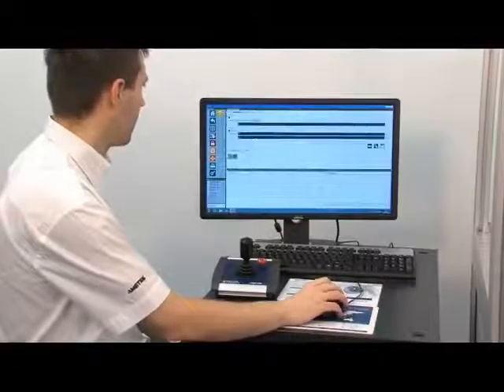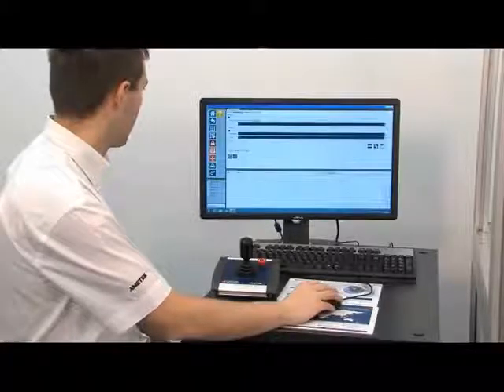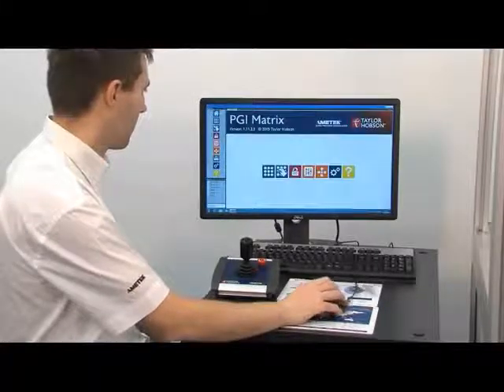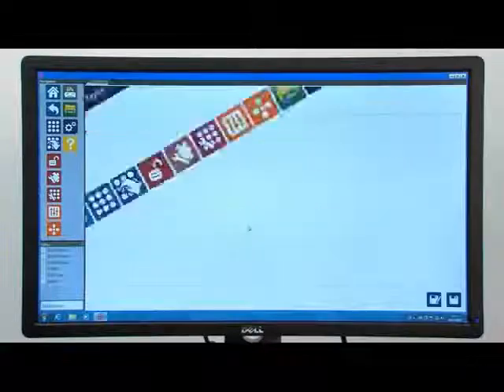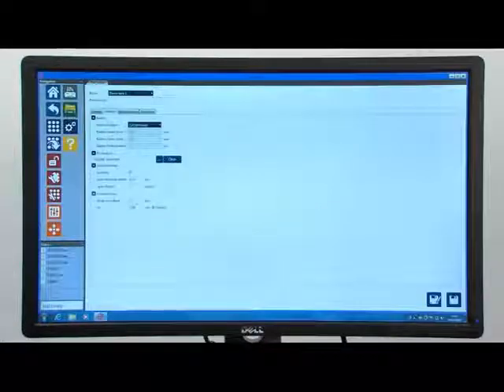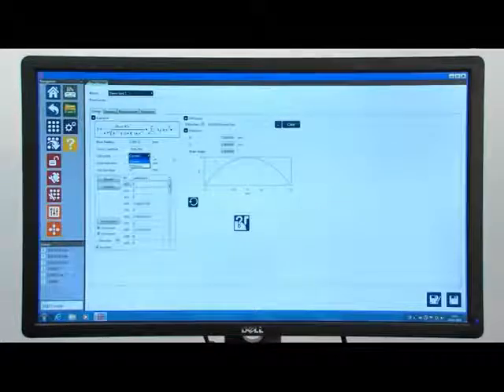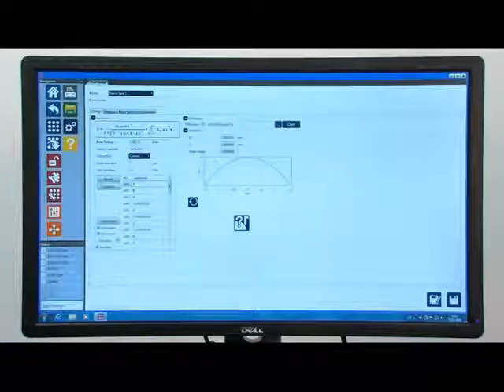The software interface has been redesigned from the ground up and offers a dedicated user-friendly interface for the specific measurement of optical moulds and lenses, presenting clear control options to the operator, ideal for production use.